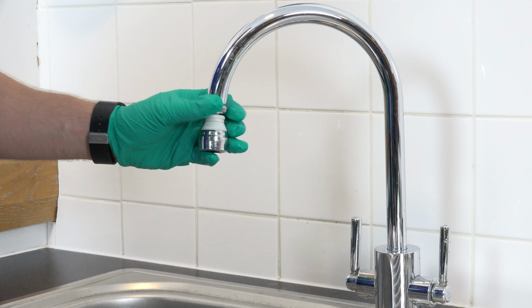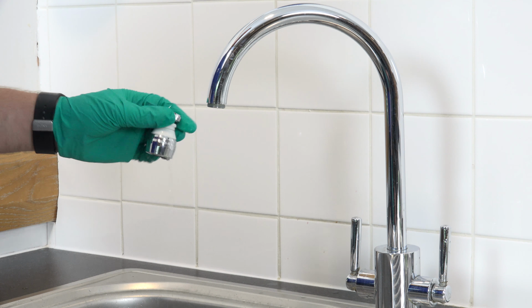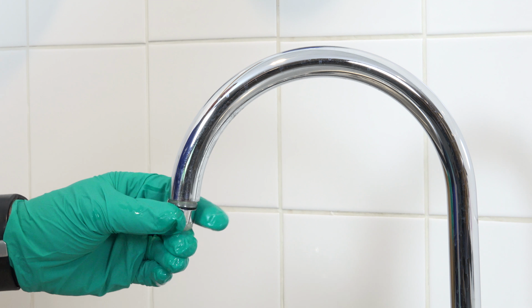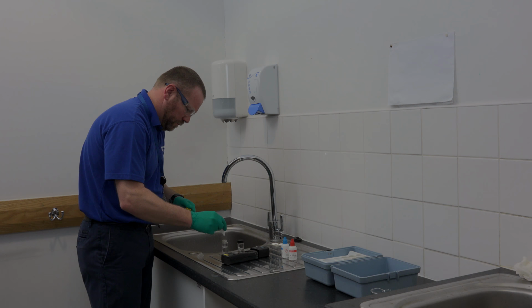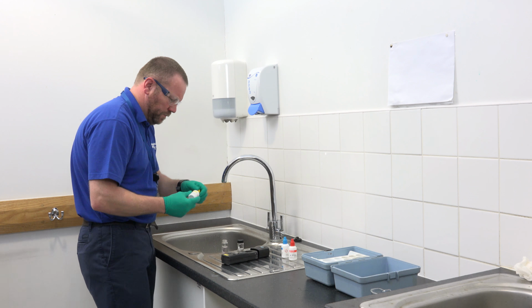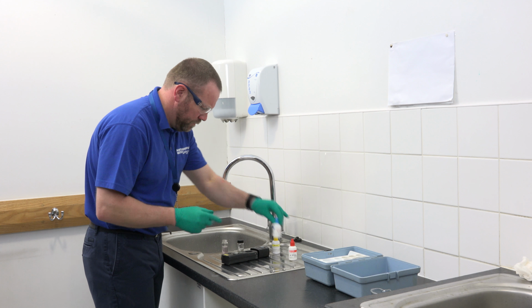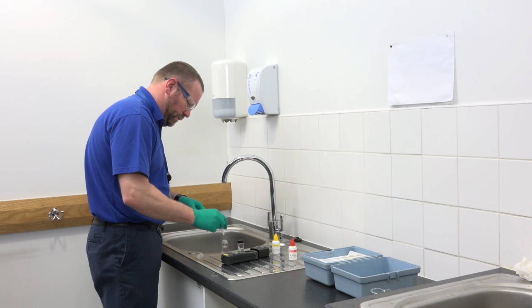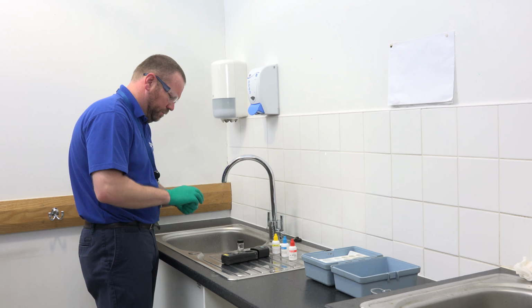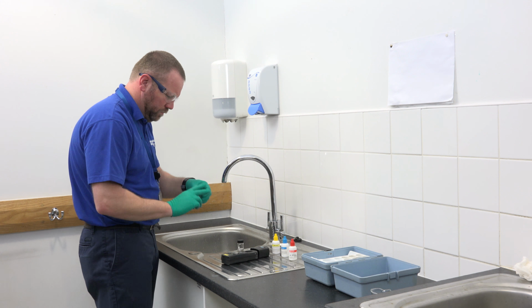Having followed the advice in video number 4 on selecting suitable sampling taps, you will already have removed any tap attachments and any removable tap inserts. Before sampling, it's important to establish a stable residual chlorine reading in the supply being sampled. This chlorine level will be used as a background indicator value to demonstrate that we've returned to normal residual chlorine levels following tap disinfection.